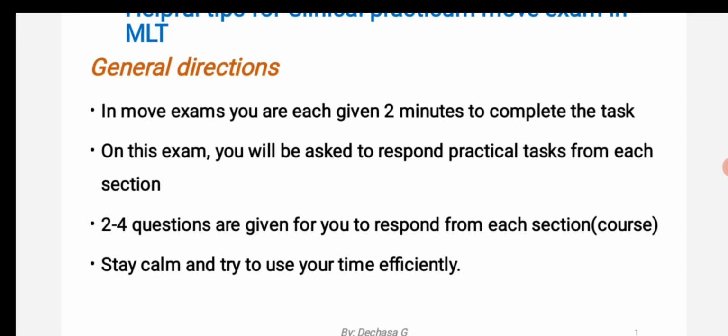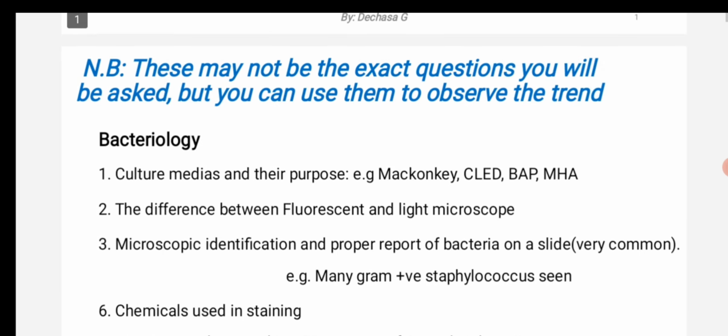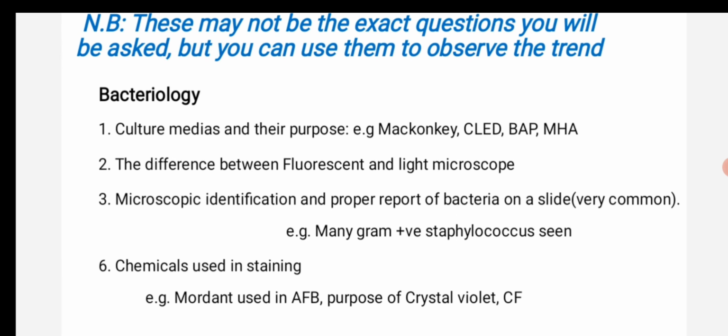So let us go to the exam. You should know that these may not be the exact questions in every section. We'll see the most common questions that usually are presented. So the first section will be bacteriology.